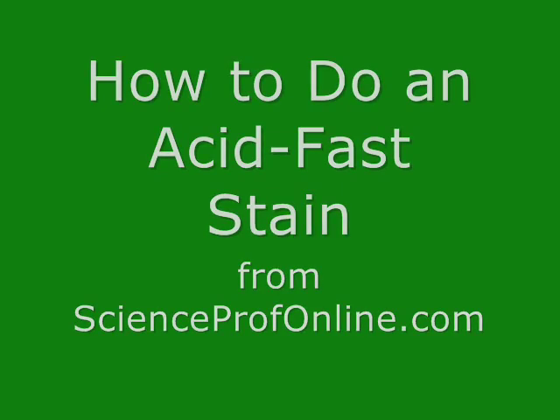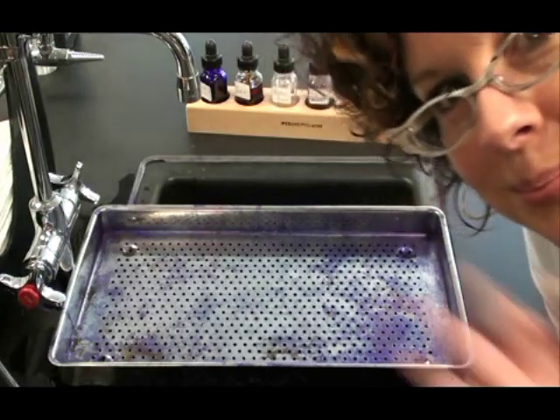In this video, I'm going to show you how to do an acid fast stain, also called a Ziehl-Neelsen stain.